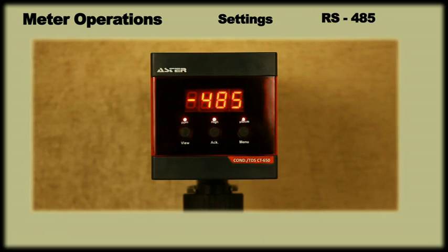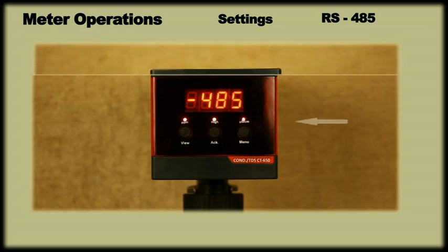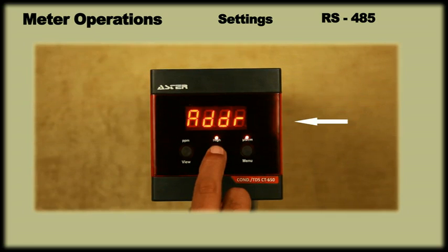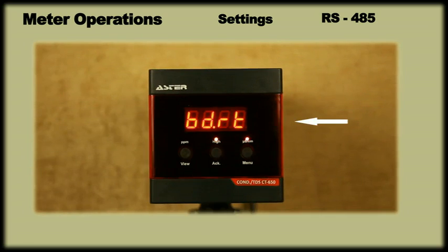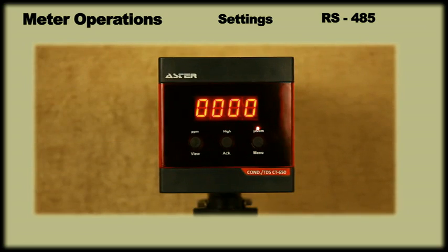Let us now understand the settings for RS-485. For meters with RS-485 output, only after setting the device ID and the baud rate, one would be able to communicate with the instrument. Let us understand how to do these settings.